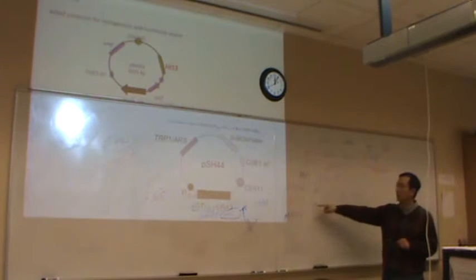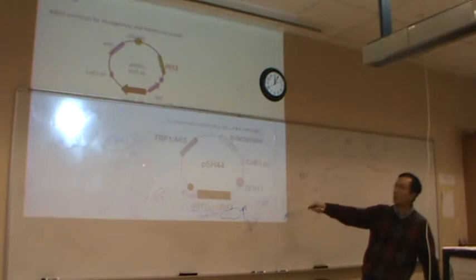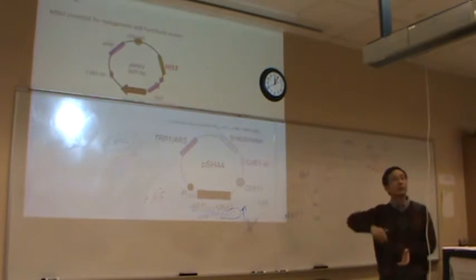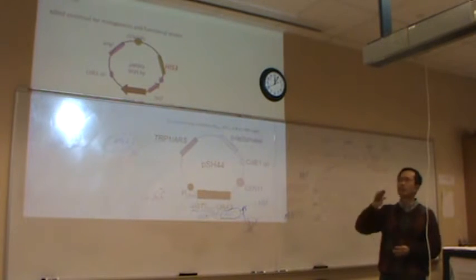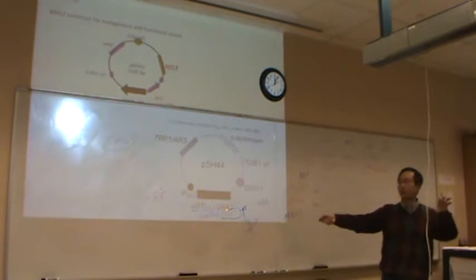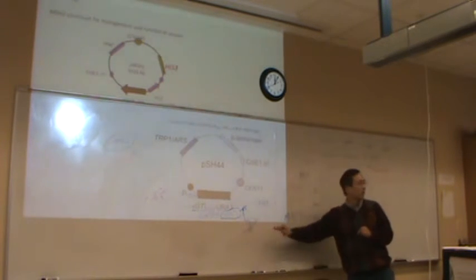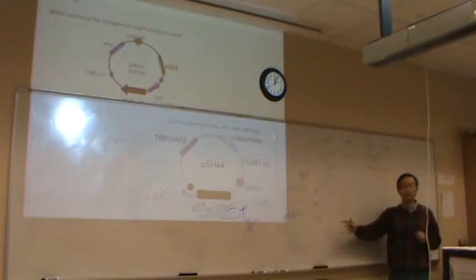Yeah. We have the vector control. The vector has a complete deletion of MSH2. That one is the maximal amount. How much damage can you do? That's the maximal amount. So we have that as a scale. When this is completely deleted, URA3 has the maximum chance to become a mutant, and so there's a maximum amount of live cells on this one, and then we can compare.